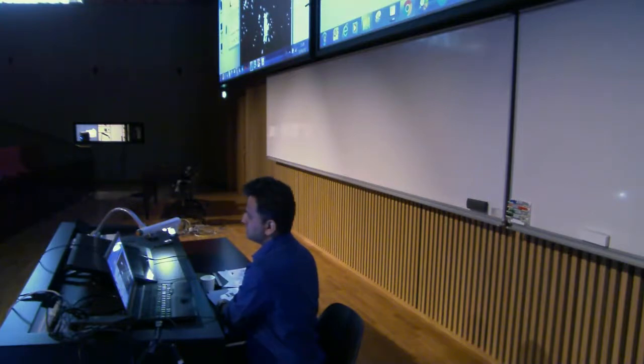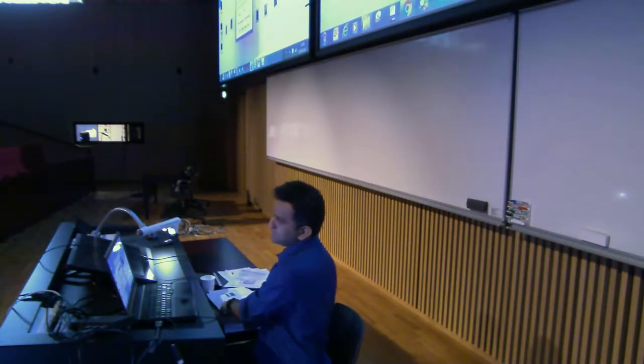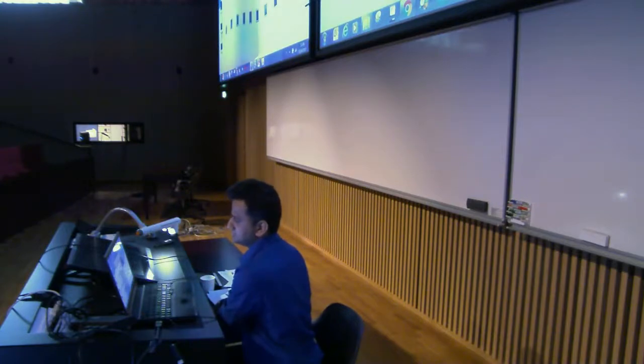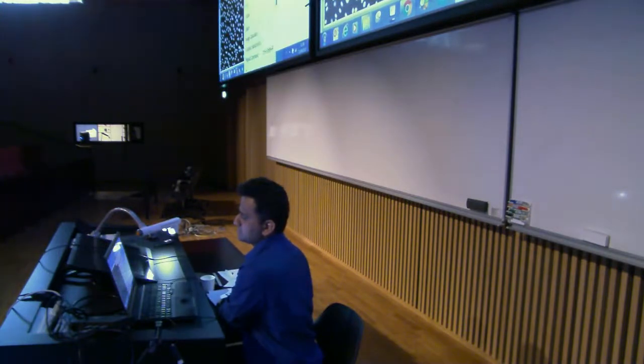But my point was that before you come to this thresholding, make sure that the quality of your image is sufficient enough to segment and threshold your data. Let's go for nuclei here. You also might want to consider the background subtraction, okay? And the way you do it is just go to process and subtract background.